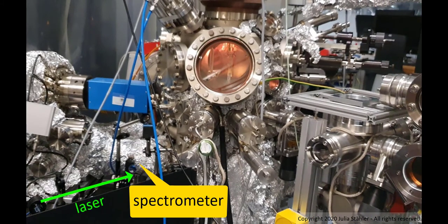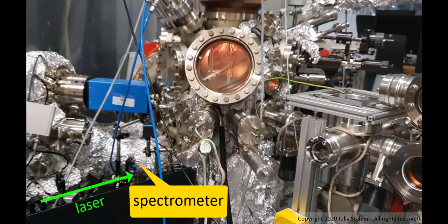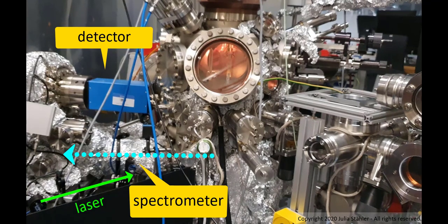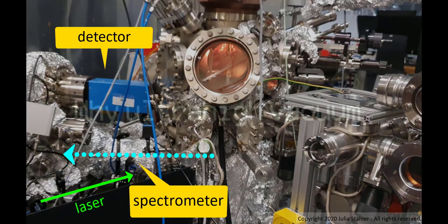When we now hit the sample with laser light, we can eject electrons, which then travel all the way through the spectrometer to the detector without any collision with molecules. So, ultra-high vacuum enables photoelectron spectroscopy.